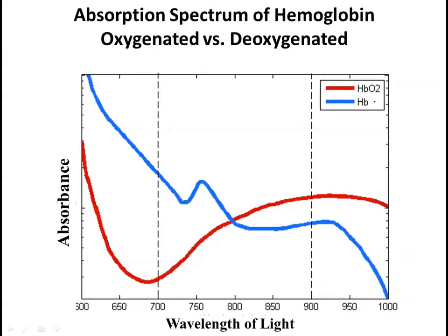First, we need to look at a portion of the absorption spectrum for deoxygenated hemoglobin, which is shown here in blue, and compare that with the absorption spectrum for oxygenated hemoglobin, which is shown here in red. Now remember, back in the spectrophotometry tutorial, one of the experimental tips for the curve experiment in this lab was to use a wavelength of 660 nanometers on the spectrophotometer.